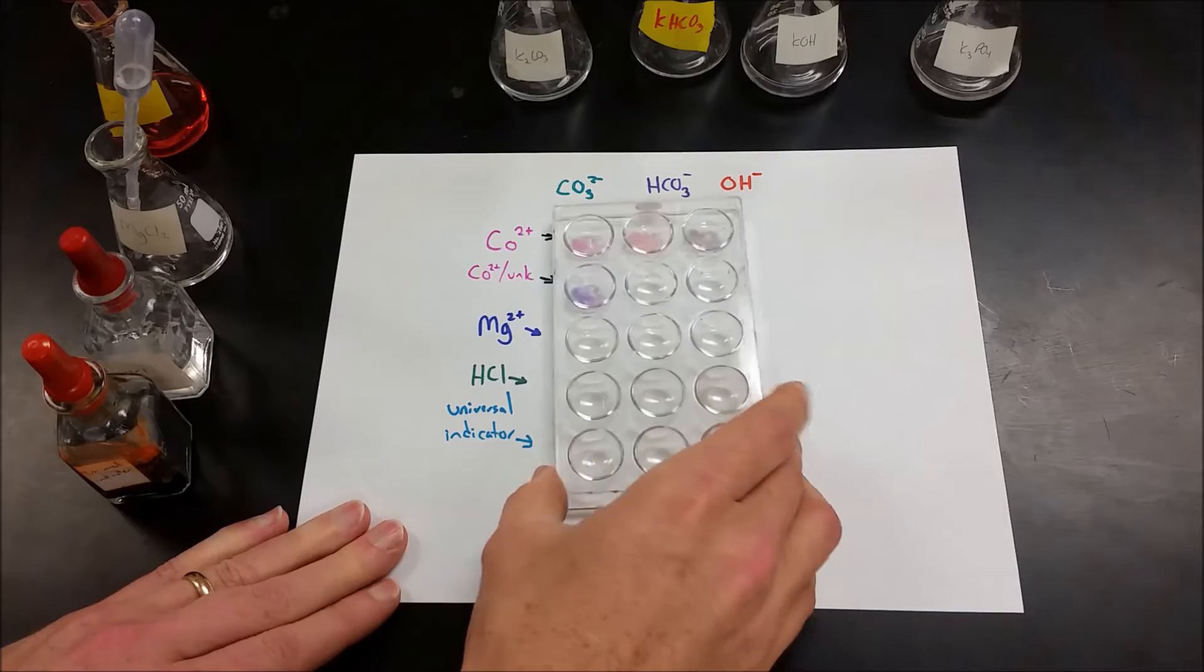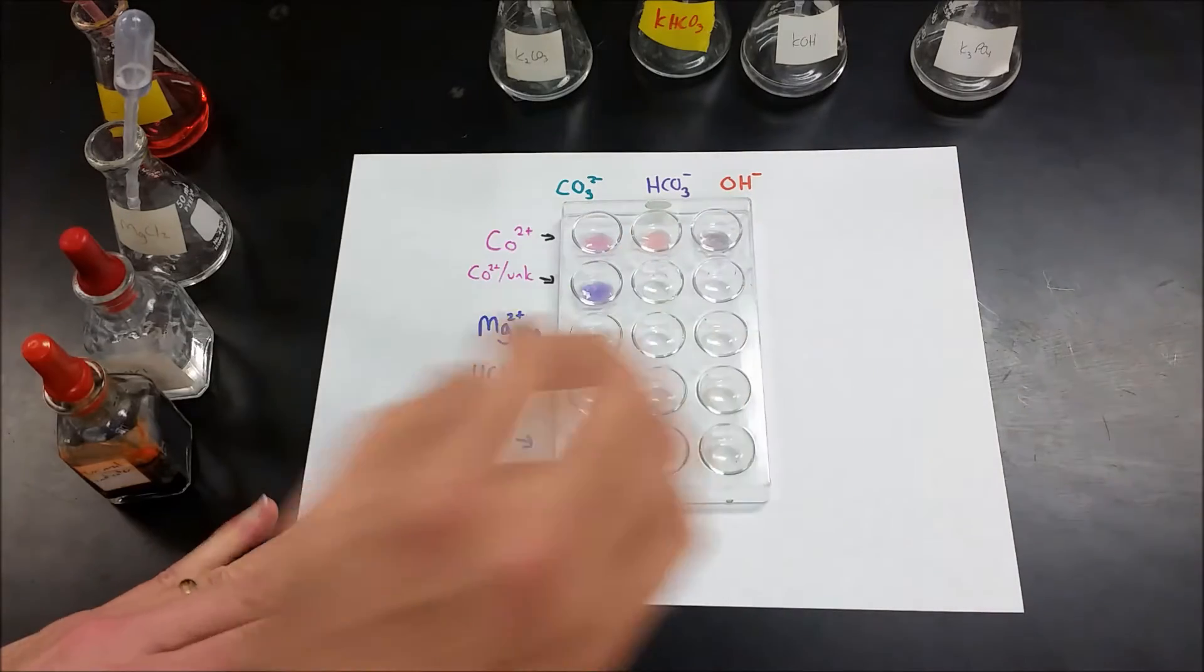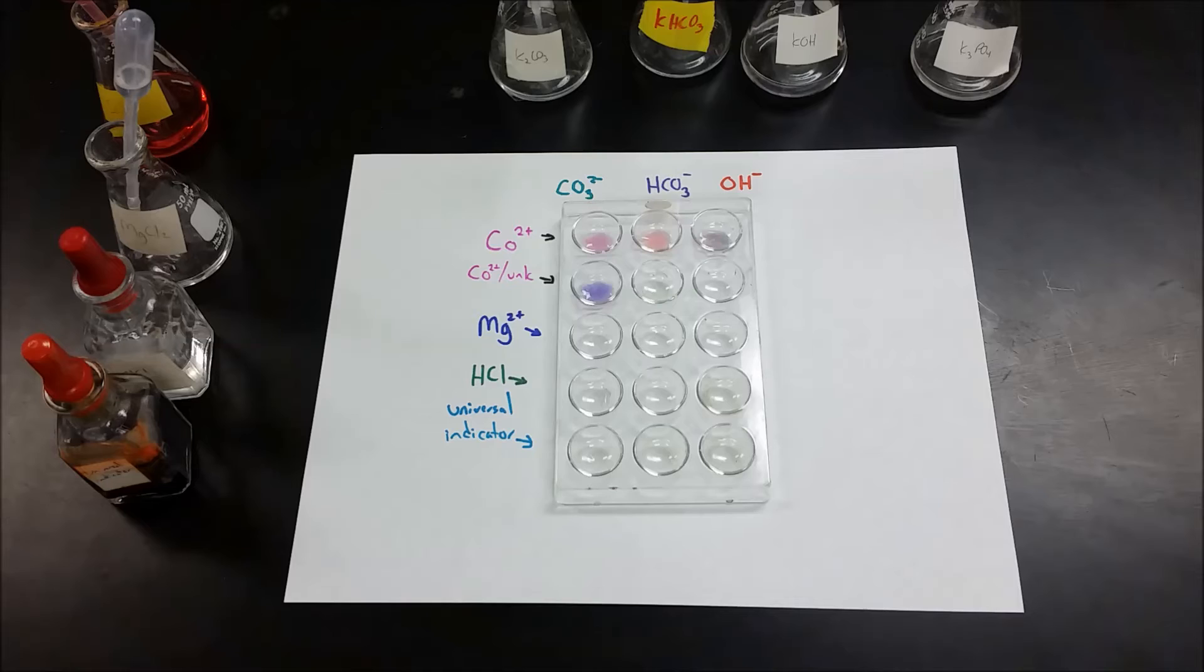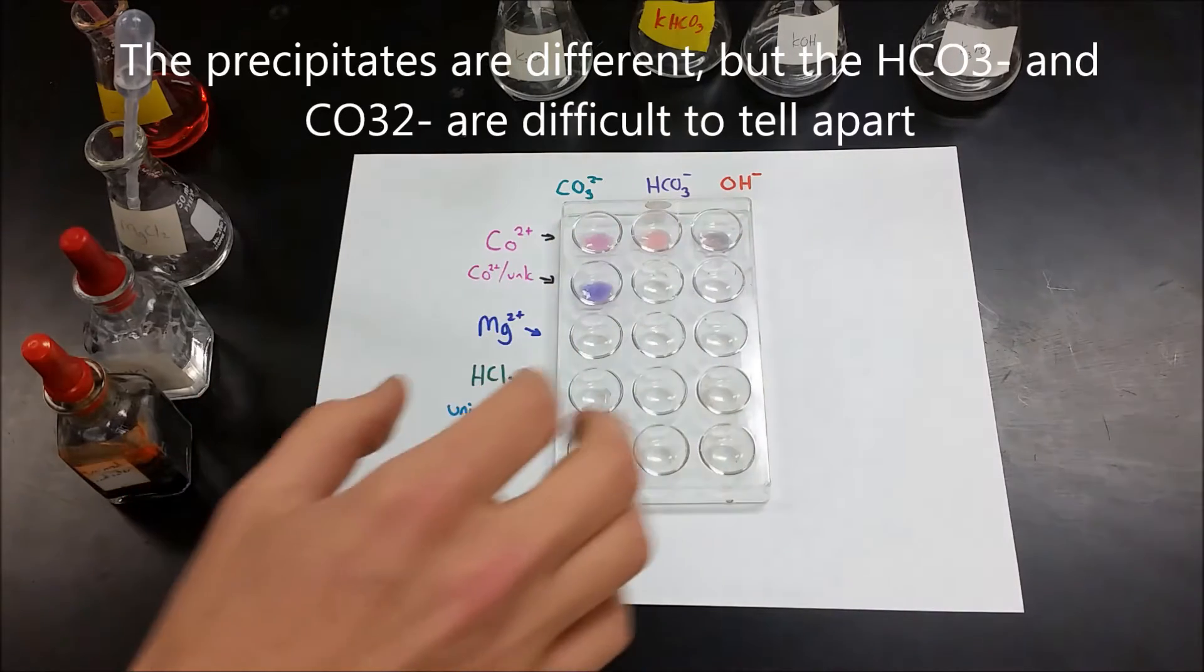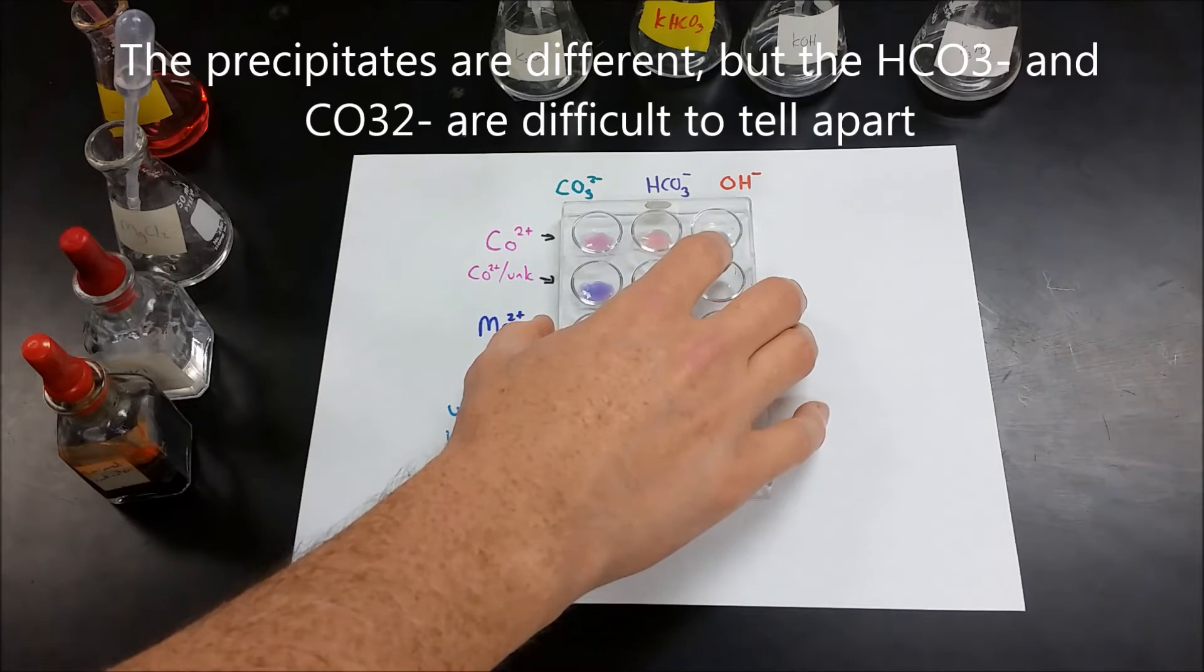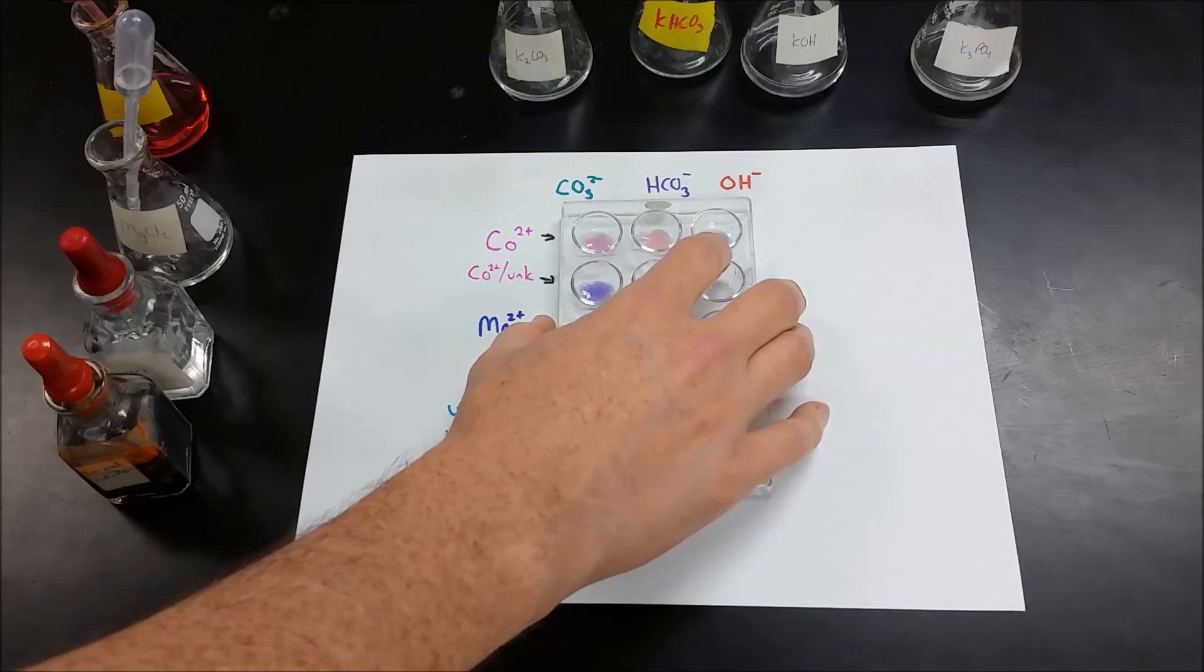Now what you'll find is that the carbonate and the bicarbonate have very similar precipitates and are probably so close that it's not going to be something you can tell apart. You might be able to tell because they are subtly different. But the key here is you eliminate whether it's a hydroxide or something totally different.